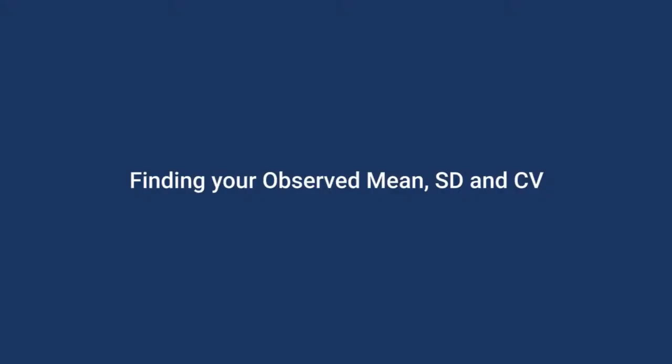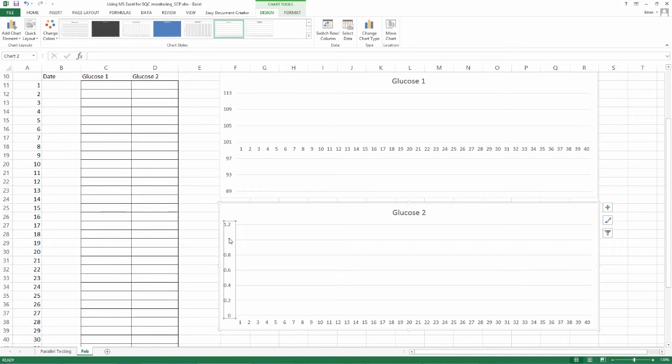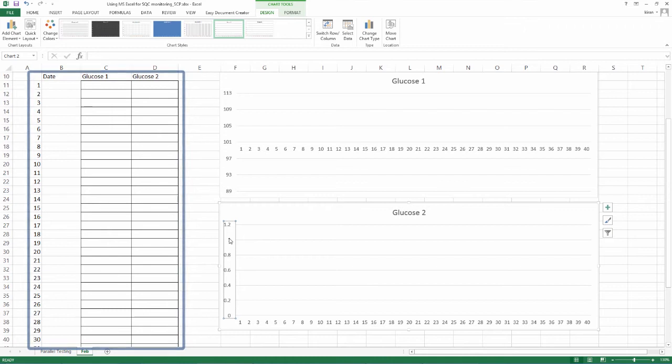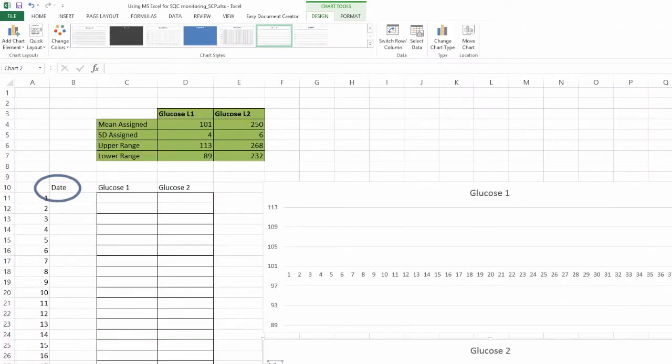Finding your observed mean, SD and CV. Before we input values and demonstrate the graph live, there are few more things that we need to understand about imprecision monitoring an excel sheet. Let us go back to our numbers in Feb. You have allocated 40 rows for this month, taking into account the need for corrective actions. We will be entering daily values in these rows.